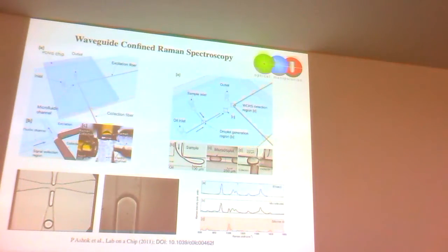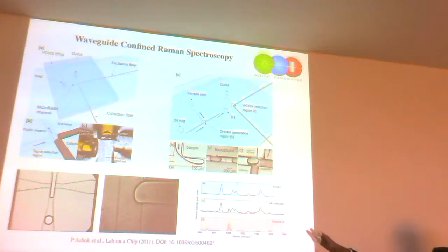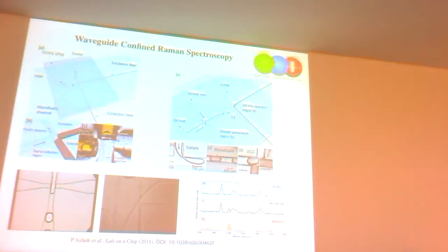But if you take a biopsy, you may wish, if you've isolated some cells, to do further analysis on chip with some of those, for example. So if you like, complementary, you're absolutely right. They're not really going to answer a more global question of, do I have cancer or do I... that's maybe where the probe would work better. This is more for smaller numbers of cells, or maybe doing little blood analysis, for example, or glucose sensing.